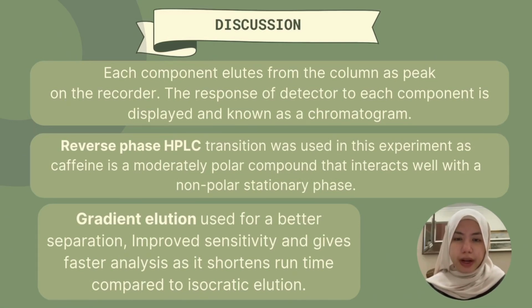The most important aspect of HPLC is the high separation capacity, which enables the batch analysis of multiple components. Even if the sample consists of a mixture, HPLC will allow the target components to be separated, detected, and quantified. Also, under appropriate conditions, it is possible to attain a high level of reproducibility with a coefficient of variation not exceeding 1%. It also has a high sensitivity while a low sample consumption. HPLC has one advantage over GC column: analysis is possible for any sample that can be stably dissolved in the eluent and need not be vaporized. For this reason, HPLC is used much more frequently in the field of biochemistry and pharmaceutical than the GC column.